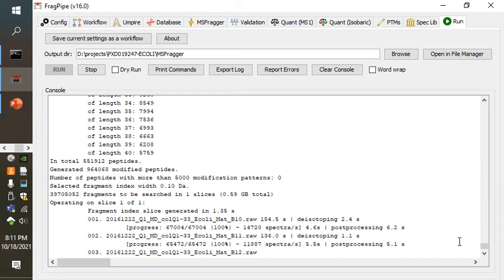The question for me would be, does Philosopher also run on all those platforms? And I do know that Philosopher is available for Linux as well as for Windows. I think there may be a Mac build, but I'll have to ask Alexey about that one because I'm not actually sure. But at least the search part itself can be run on a Mac as well, just because it's all Java software, it's content to do that.